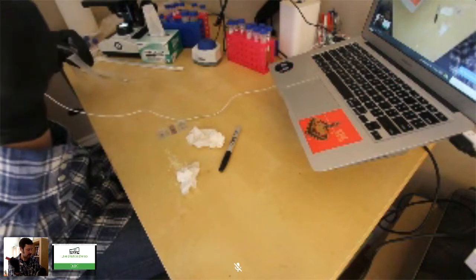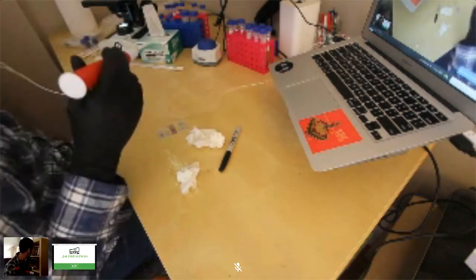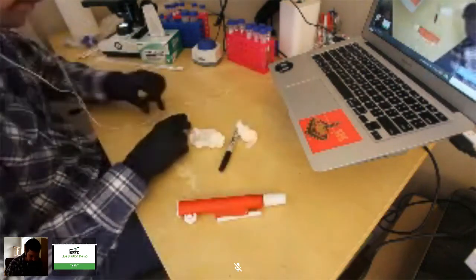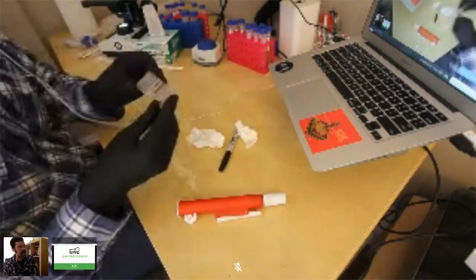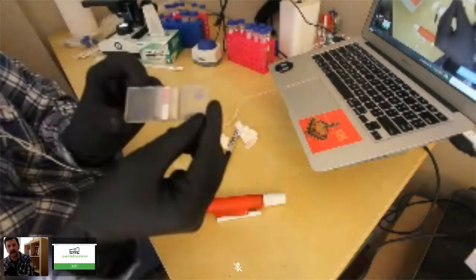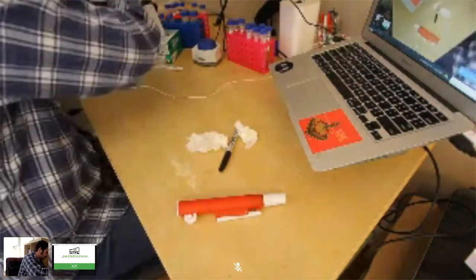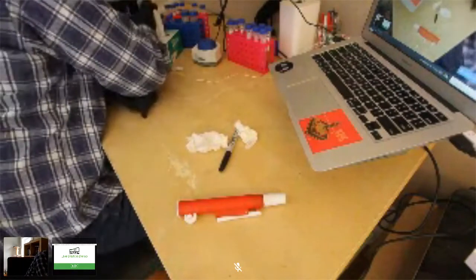All you have to do is make sure that you get the liquid onto the glass right beside the cover slip, and the capillary action will pull it in for you. I don't know if you'll be able to see that really well, but this is what a loaded counting chamber with dye looks like. Let's put it underneath the scope, and I'll just get it in focus here.